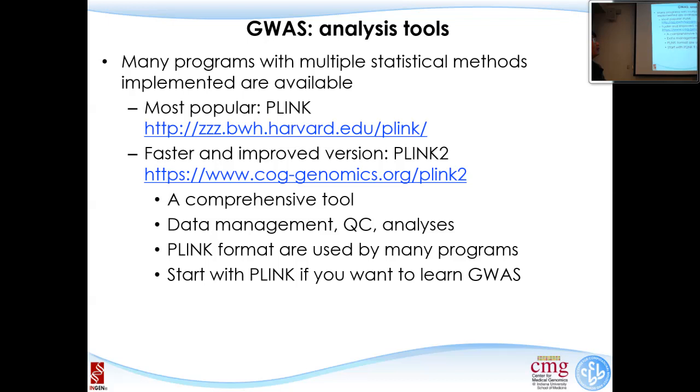I prefer you to use this Plink 2 tool because it's fast, about 100 times faster, but their documentation is kind of horrible. So you read the original documentation first to get familiar with what the commands do. The usage is almost the same.